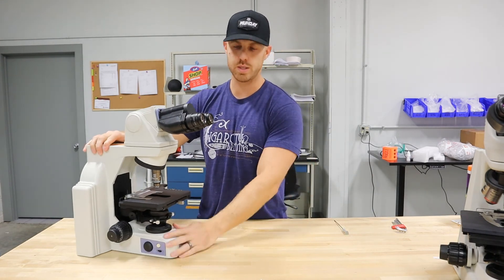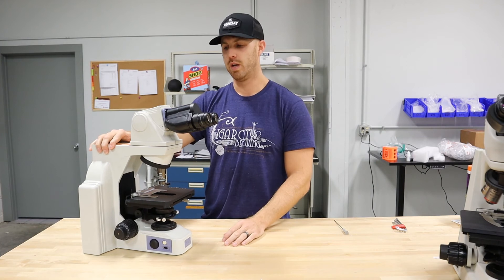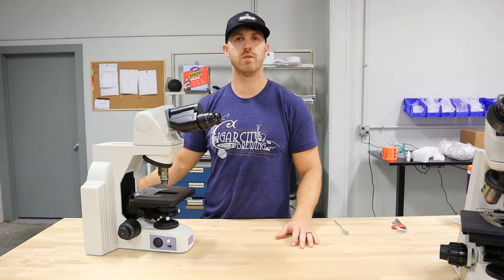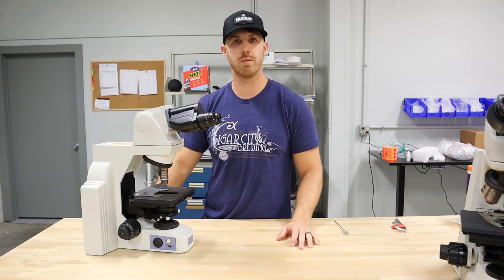Once you do that, you'd want to set up Köhler illumination — you can check out our other videos on how to do that. And the microscope is ready to use. If you have any questions, give us a call at 919-775-5596, or you can email us at info@mundaymicroscope.com, or check us out at our website, mundaymicroscope.com. Thanks.